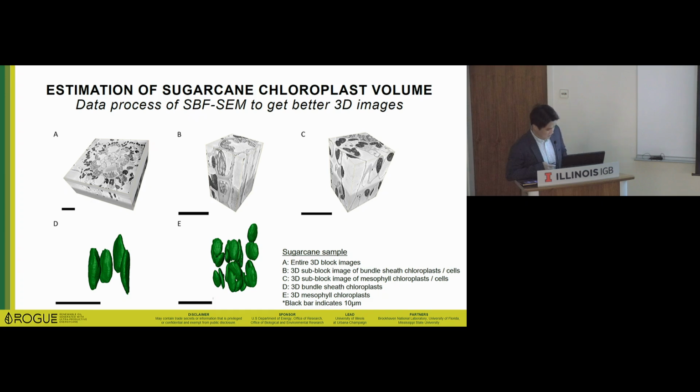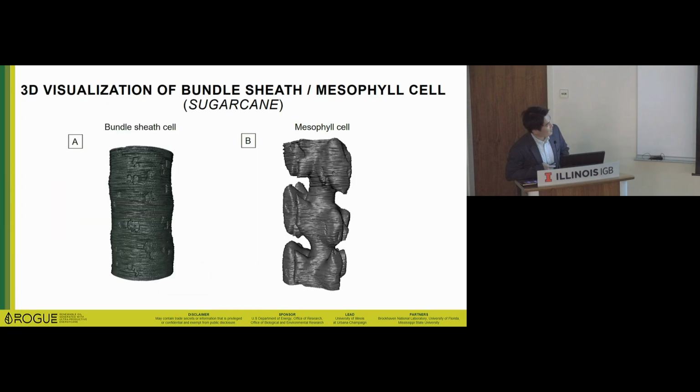Basically, currently what we have is the information on cell volume and plasmodesmata, and regarding the chloroplasts and the cell volume, we can quantify volume by volume how much they occupy inside the cell. We have that information, and also the surface area versus volume information. But we don't have any particular specific information on other components. Yeah.